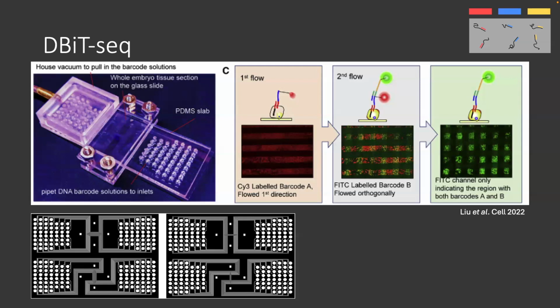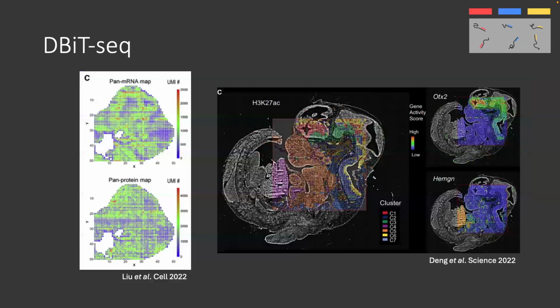But the very amazing thing about this technology is that it was really easily adaptable to any of the existing single cell methods. So here's an example of some data where they sequenced all the RNA. They had proteins with a barcode that they could sequence, so they could sequence the spatial location of proteins. Here it's a histone marker that they could sequence. They could do ChIP-seq, all in situ. So this was a great platform to bring in existing technologies into and give it a spatial dimension.